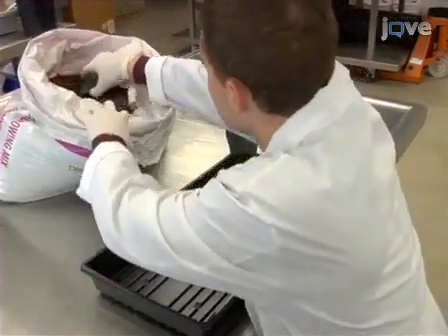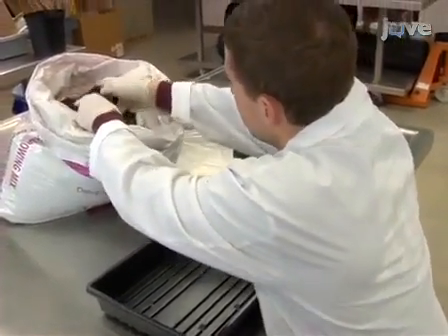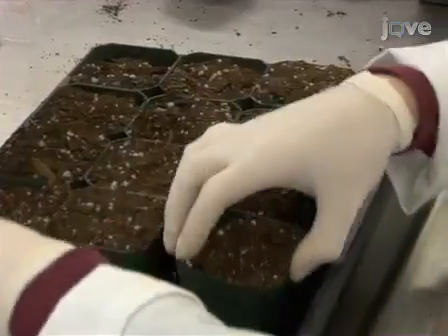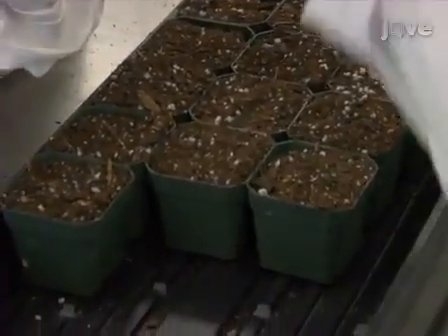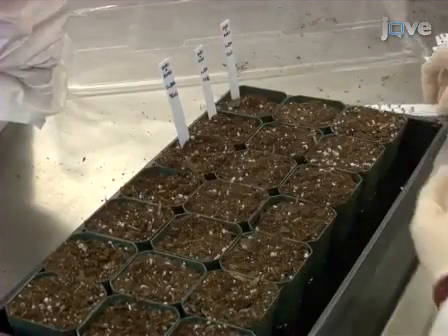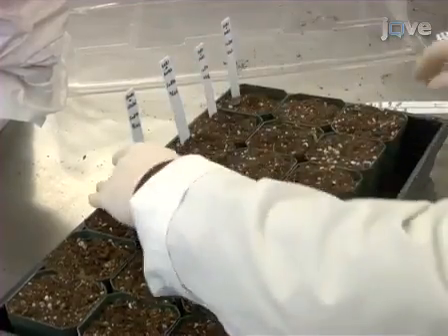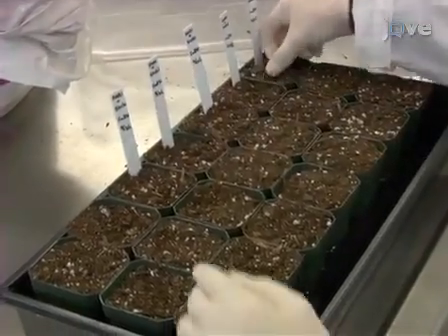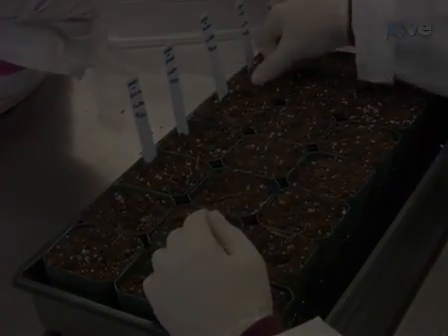To grow cotton seedlings for virus-induced gene silencing, add MetroMix 700 to several 7-centimetre pots and place the filled pots into a tray. Next, plant the seeds of several upland cotton varieties such as Fibromax 832, Phytogen 425-RF, Phytogen 480-WR, and DeltaPyne 9.